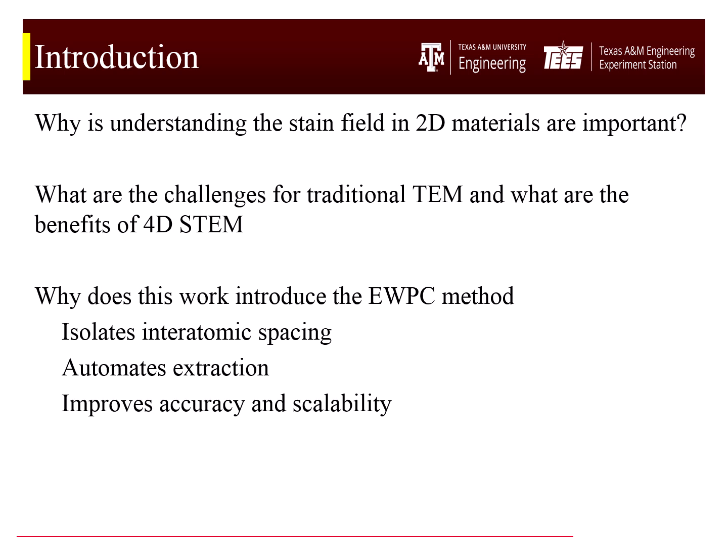To study this nanoscale structure, transmission electron microscopy, or TEM, has traditionally been used. However, in extremely thin material like 2D layers, TEM faces challenges. Because the materials are so thin, the signal-to-noise ratio becomes low, making it difficult to extract detailed information about strain at the nanoscale.